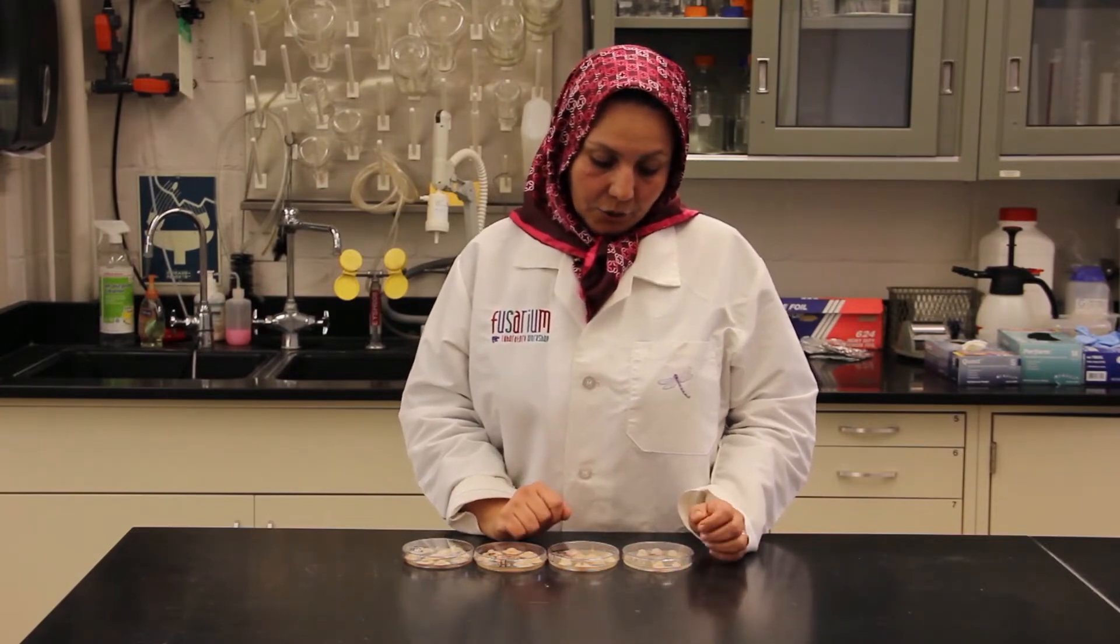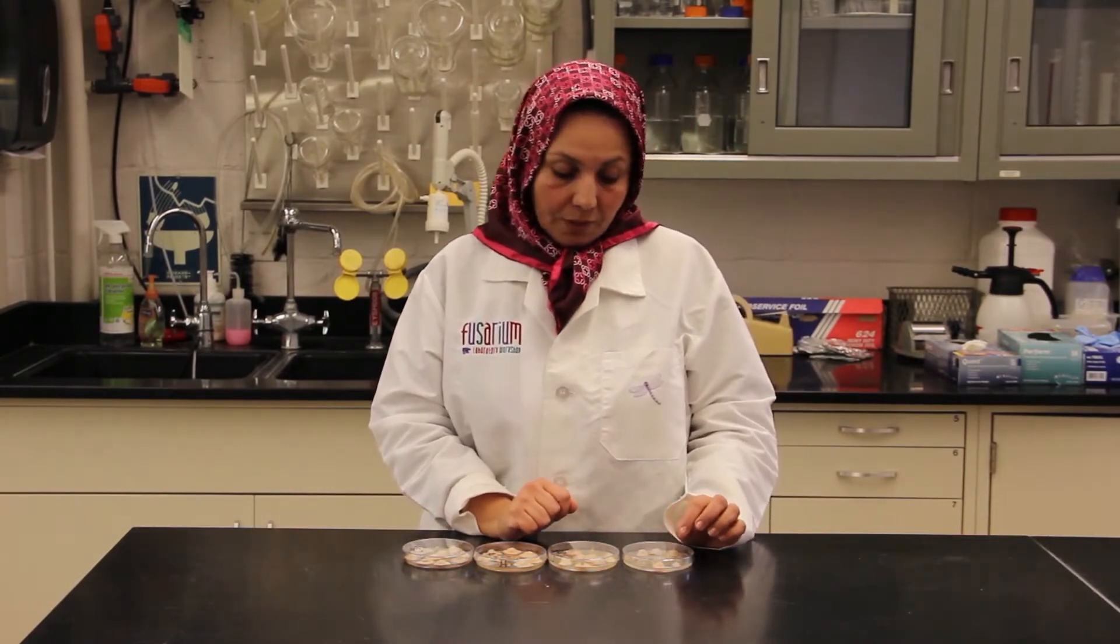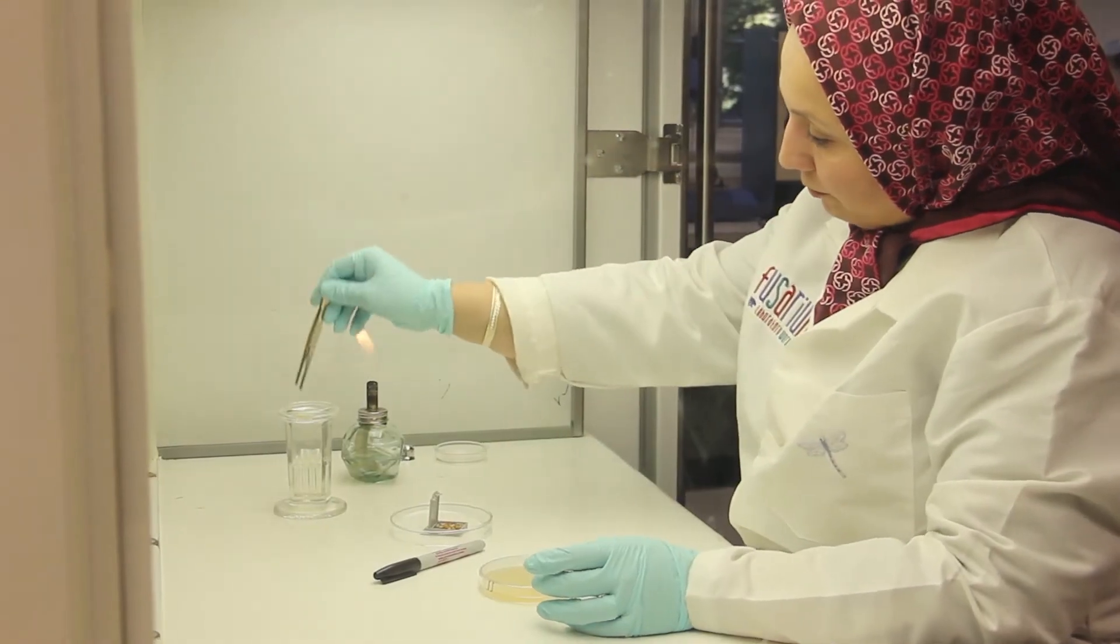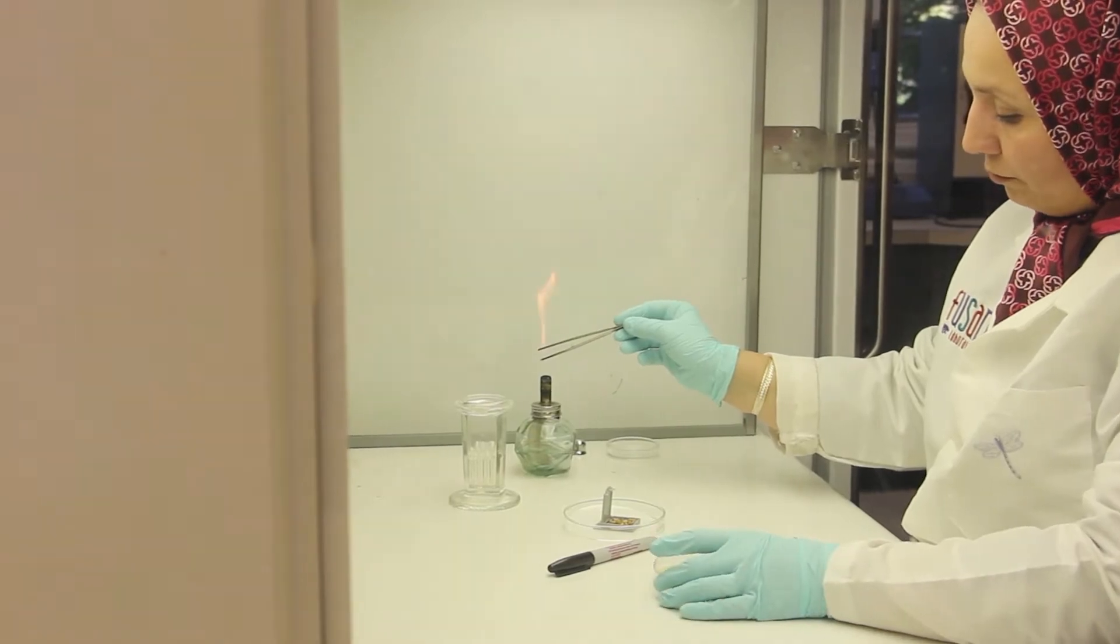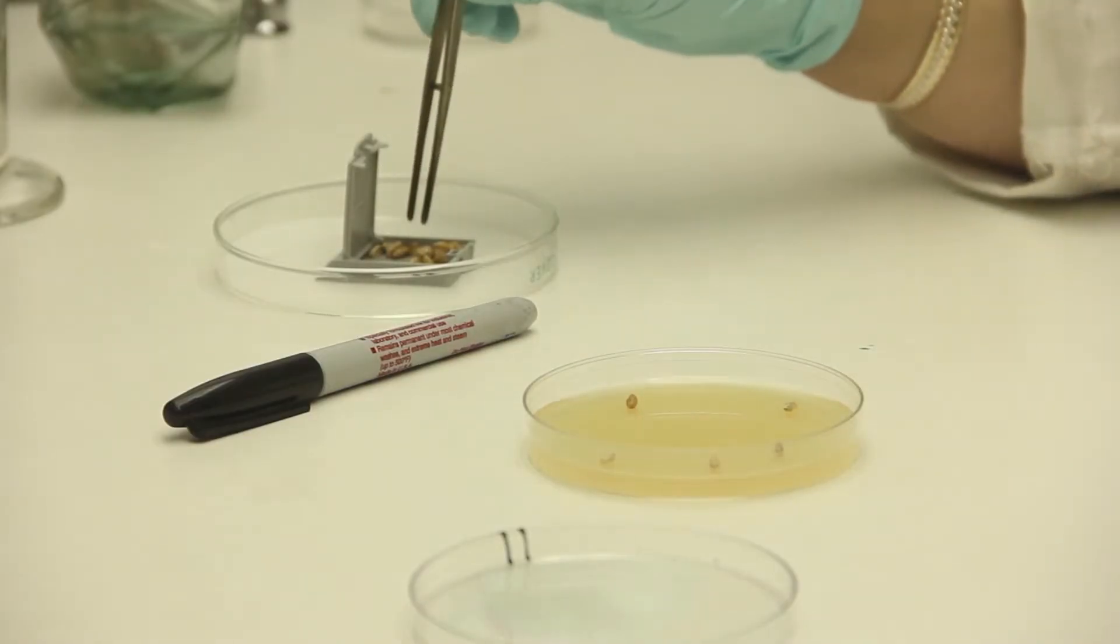After the seeds have been dried in the hood, we plate them on Komada. Make sure you sterilize the tweezers by flaming and take the seeds and put them in the Komada plate.